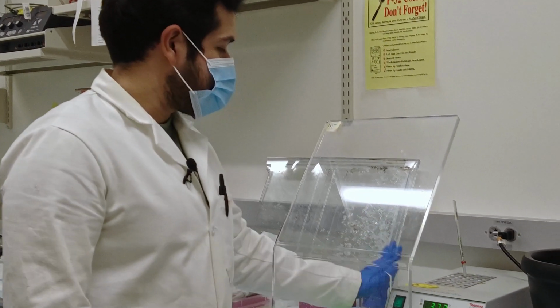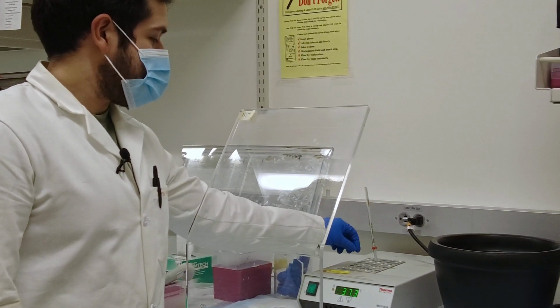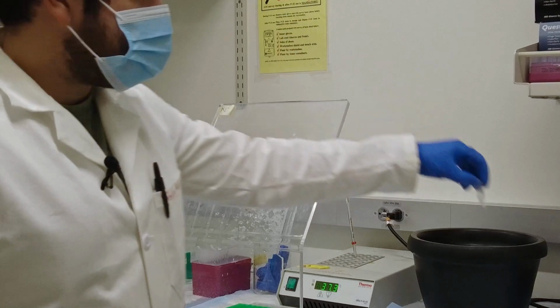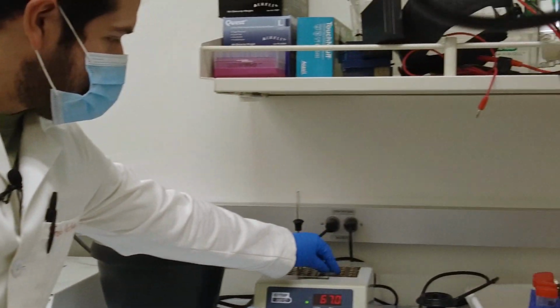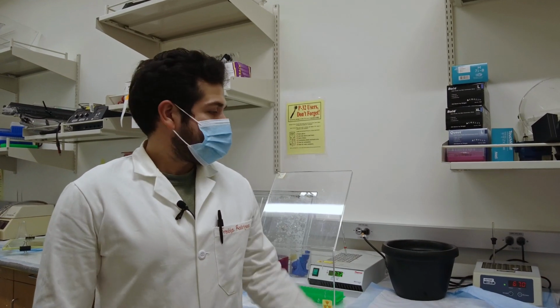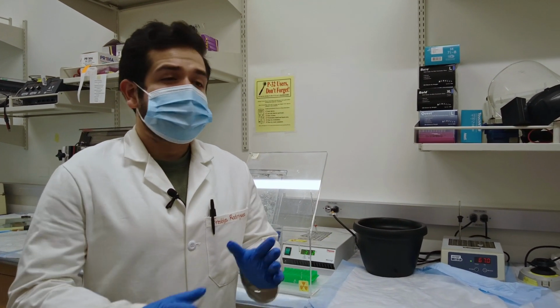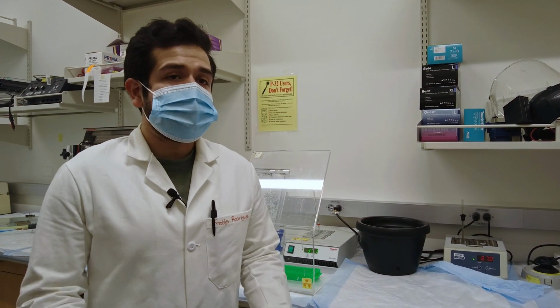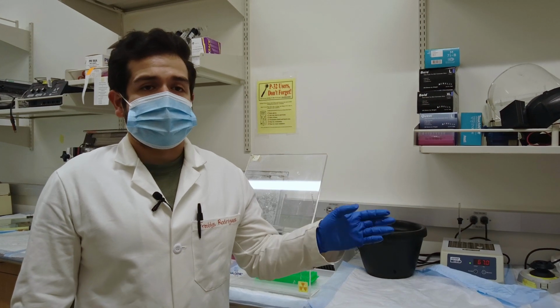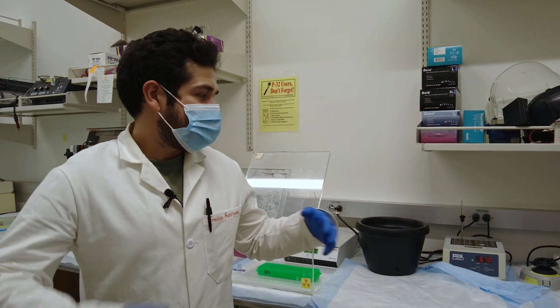The next thing, once the hour has passed, is we're going to remove this radioactive primer and move it from 37 degrees over to this heat block that has been heated up to 67 degrees. The reason we are treating this reaction at 67 degrees is to heat inactivate the enzyme that's catalyzing the addition of this radioactive phosphorus onto the DNA primer. We're going to do it for 10 minutes. We don't need it anymore, and so this will help us easily kill the reaction.